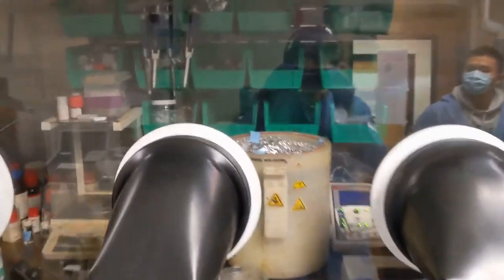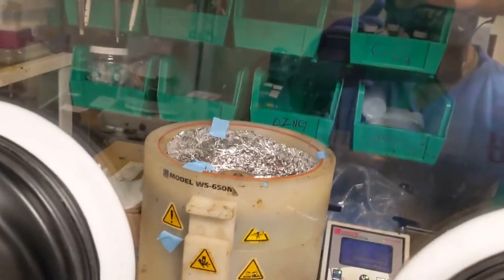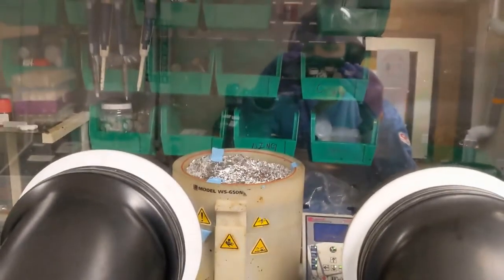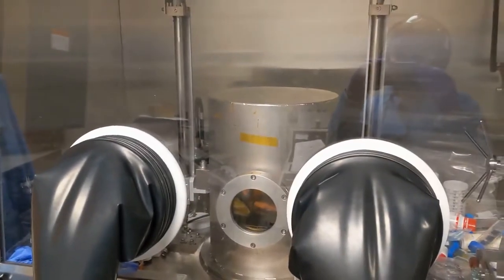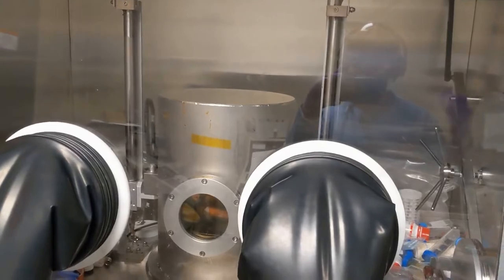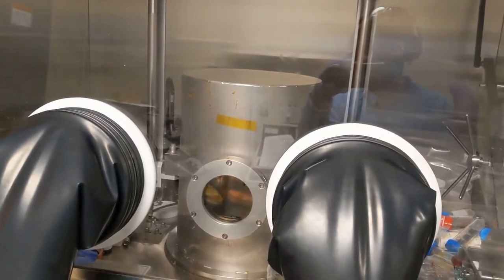The first step is going into the right glove box. Inside, we have all the equipment to measure out our samples, solvents to dissolve them, and our spin coater, where we can drop solutions onto a glass substrate, spin it quickly to get a nice thin film, and anneal it on the hot plate. Once we have all of our different layers on the substrate, we take them over to the left glove box, where we have our thermal evaporator. All of this is done under nitrogen, so we never have to expose the devices to air.